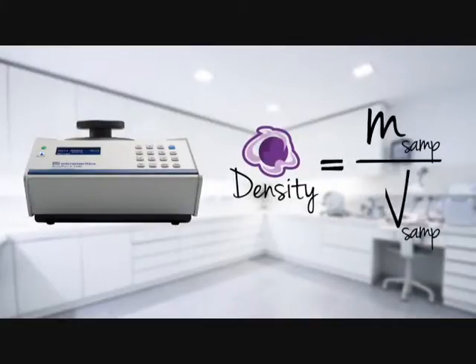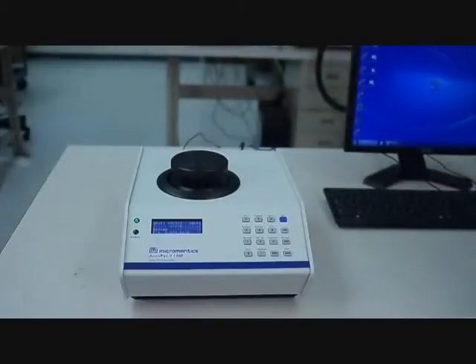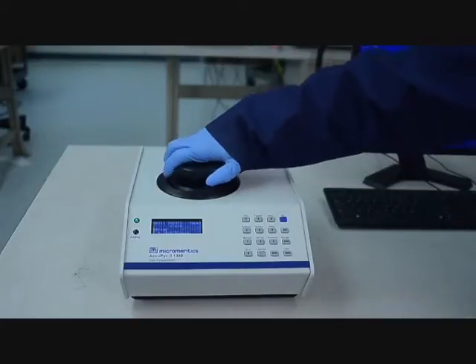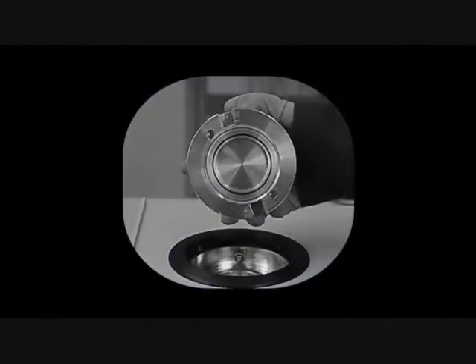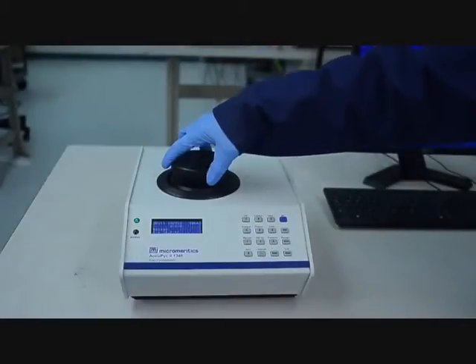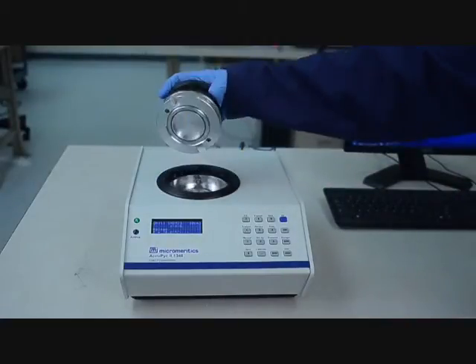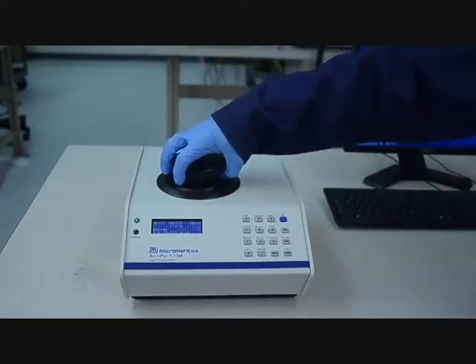But before we get started with the demonstration, let me point out a key feature of the AccuPyc. The AccuPyc sample chamber has a unique closure system. Competitive instruments employ a screw-threaded cap. As a result, the seal is always uncertain. This can affect your volume data. With this AccuPyc cap, the patented bayonet mount and roller mechanism ensures an identical tight seal every time.